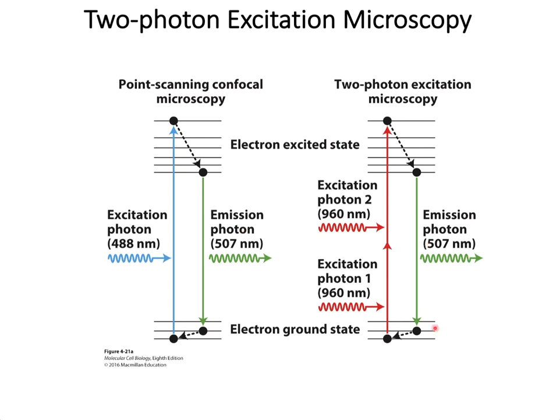So what is the advantage? The advantage is that the 960 nanometer near infrared wavelength is invisible as it is beyond the visible spectrum of light, and thus in a thick specimen it does not scatter the light as the 488 nanometer visible wavelength does. This produces a sharp, crisp image in a thick specimen.